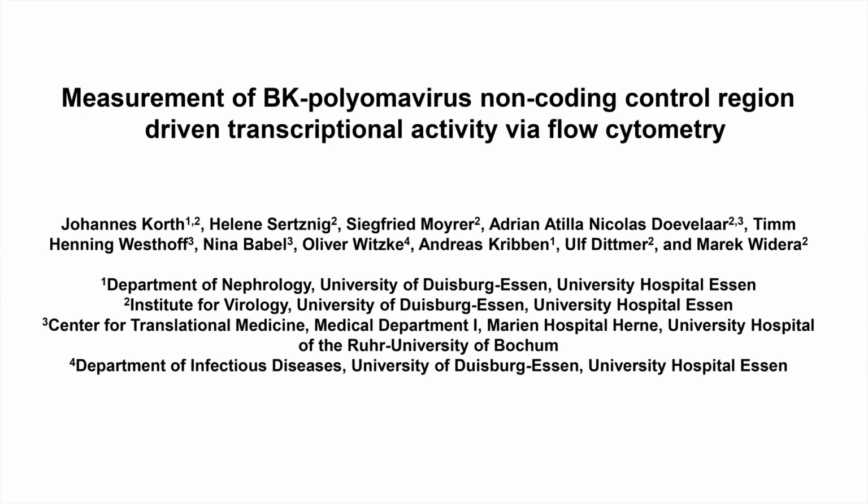The overall aim of this protocol is to measure BK-polyomavirus non-coding control region-driven transcriptional activity by measuring dual fluorescent cells via flow cytometry.